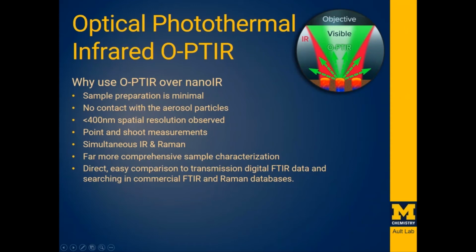We're able to do point and shoot measurements, and we were able to do simultaneous IR and Raman, which I will show some data for. And we are incredibly excited about being able to couple both of those. We've also worked with some of these IR databases so far, which have been really nice for identifying features. So that's been a real plus as well.